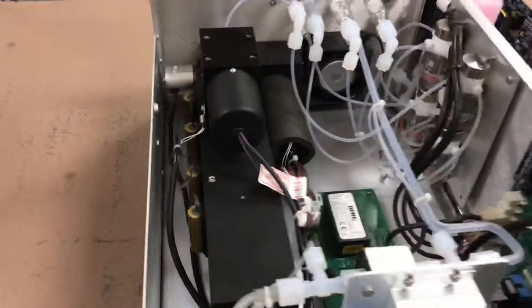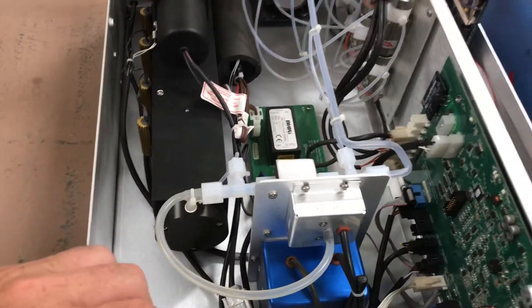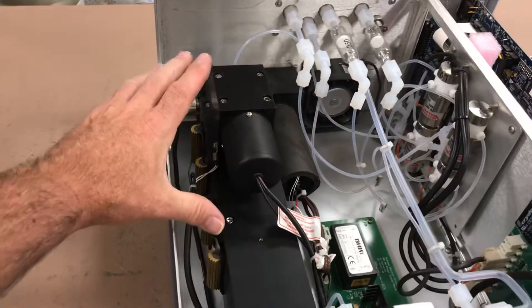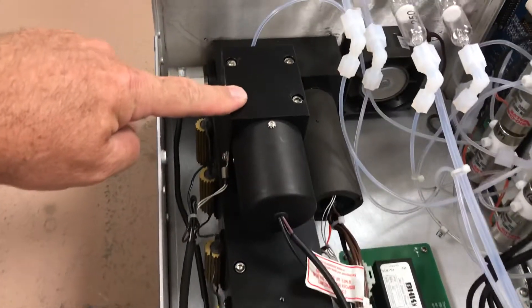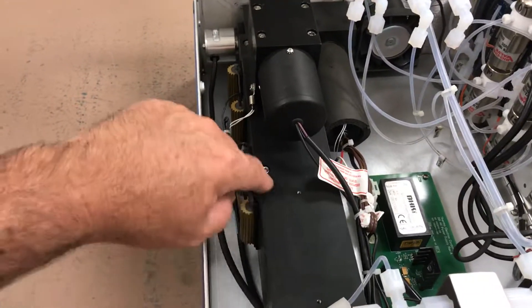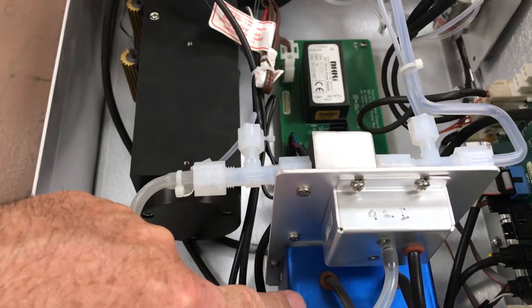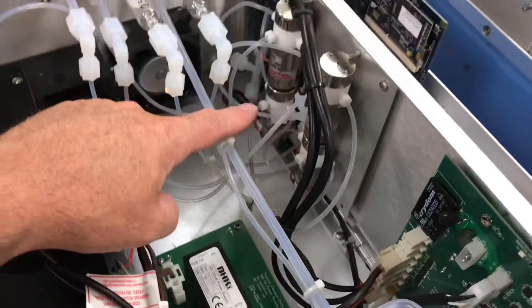Looking inside this Mercury Analyzer, model 80i, you can see some similarities if you're familiar with the 43i SO2. There's an interface board, and the bench looks a bit like the SO2 bench. It has a photomultiplier tube mounted right on the top of the bench, and a long bench for the mercury reaction to take place. It has a PMT power supply — very similar to what we've seen in other i-series analyzers. There's also a pressure sensor, flow sensor, and solenoid banks on the side of the unit.